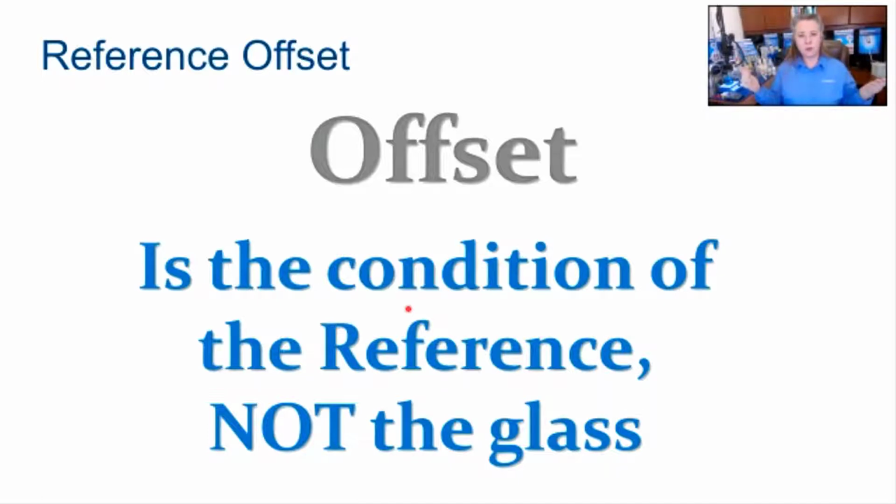Okay, what's included in the reference? That's the junction, that's the reference electrolyte, right? That's the silver chloride reference. So something has changed in that side of it.